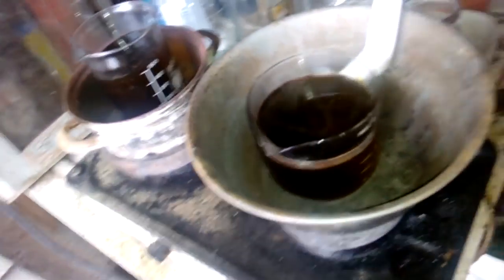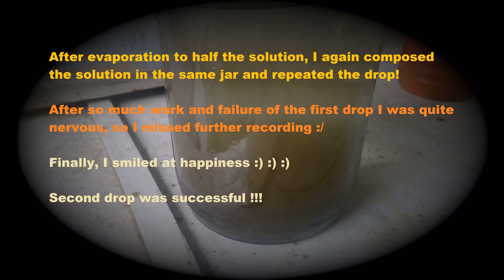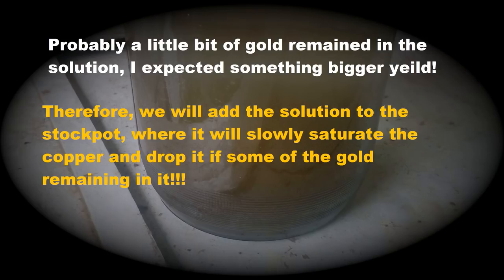Now we leave this to slowly evaporate and I will tell you what the result is. Let's do this. We'll be right back.